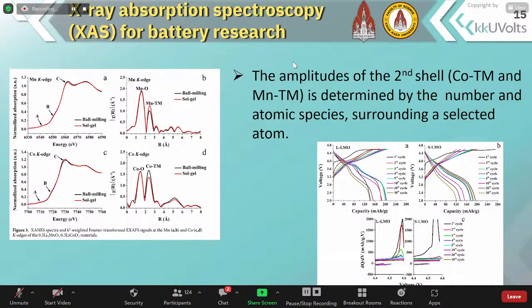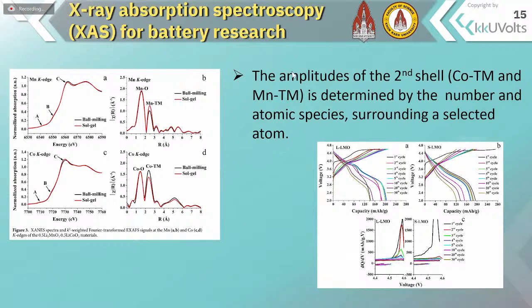This indicates that the X-ray absorption spectroscopy technique can be used to study the phase separation behavior and differentiate between the solid solution and the phase separation behavior in electrode materials.